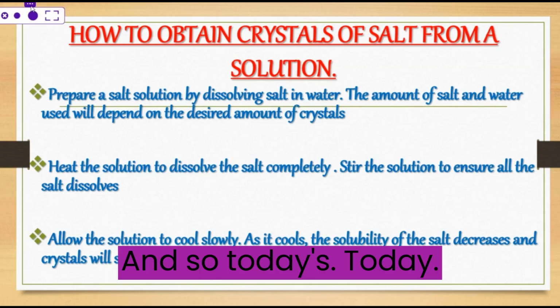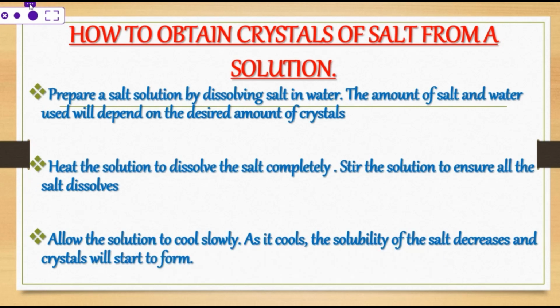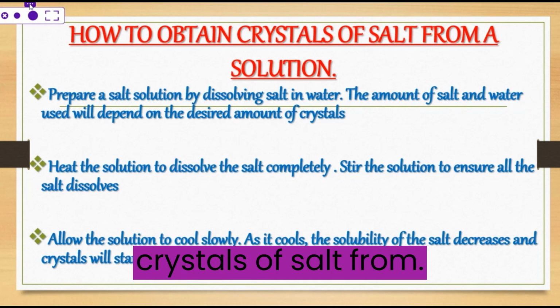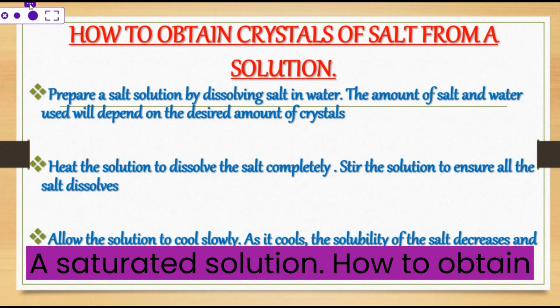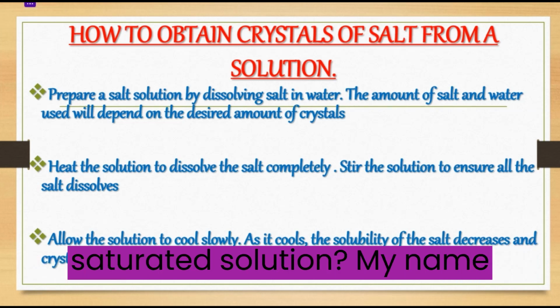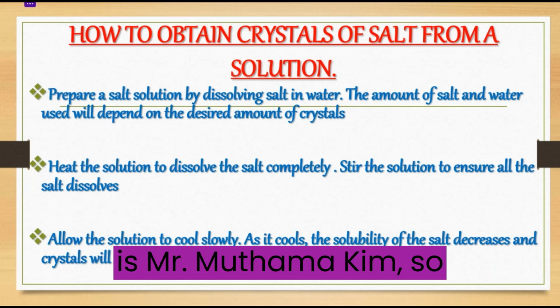Yes, so today we're going to discuss how to obtain crystals of salt from a saturated solution. How to obtain crystals of salt from a saturated solution. My name is Mr. Muthama Kimeo.